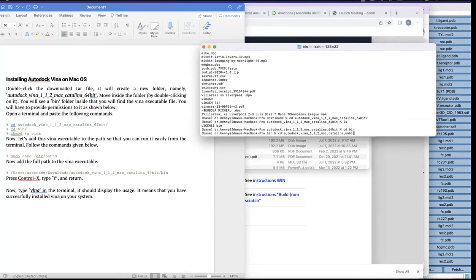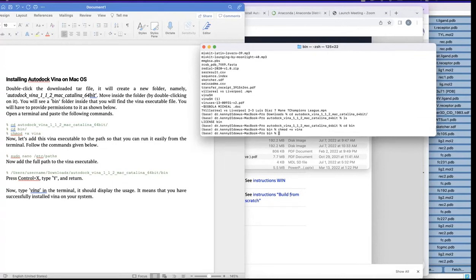Once you are in the bin directory, the next command to type is: 'chmod +x vina' — that's c-h-m-o-d, space, plus-x, space, vena. Remember this is case-sensitive. Press enter. Once you have done that, the next step is to add the Vina executable to the PATH.